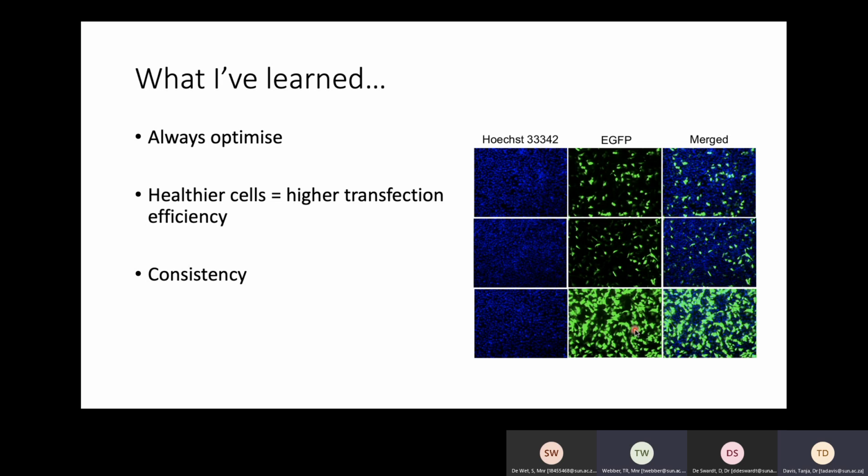Yeah, that makes sense. So I was actually thinking of going and taking control of the nucleofector myself and figuring out what everyone was doing wrong. Yeah, with electroporation, some people are a bit wary about it because you're basically introducing gaps into the membrane. If the cells can't recover fast enough, they will die. But you can play around a lot with the voltages and how many pulses it gives to the cells.